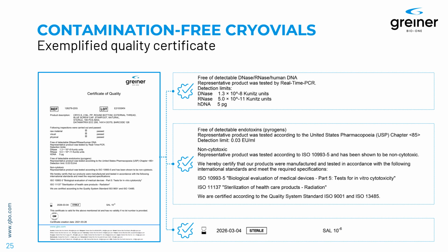There are often the methodologies provided in a good certificate. I expect this to be the case. And also detection limits are there. And these certificates are something you should ask for, you should read carefully, and then put them in your documentation and make sure that everything that is stated in the certificate is in accordance with the criteria of your workflow and your needs and demands.